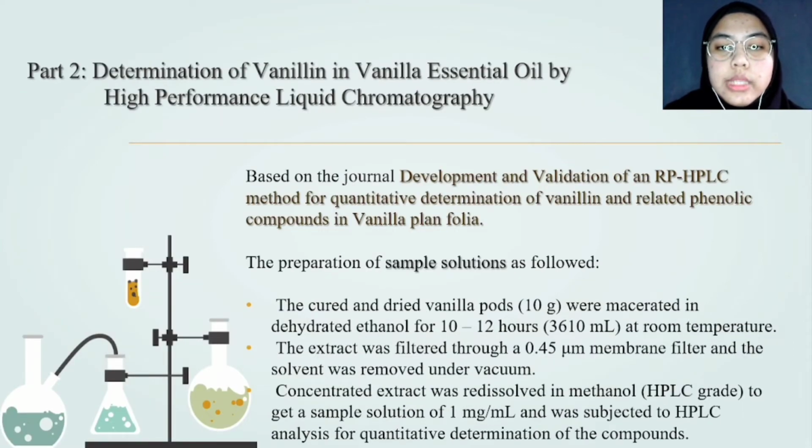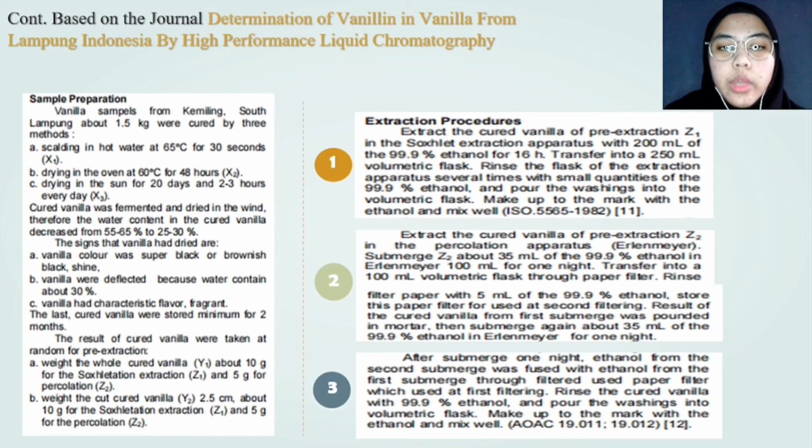Furthermore, for part 2, which is the determination of vanillin in vanilla essential oil by high-performance liquid chromatography. Based on the journal "Development and Validation of an RP-HPLC Method for Quantitative Determination of Vanillin and Related Phenolic Compounds in Vanilla Planifolia," the preparation of the sample solution can be read as follows. Meanwhile, based on the journal "Determination of Vanillin in Vanilla from Lampung, Indonesia by High-Performance Liquid Chromatography," the sample preparation was prepared as follows.